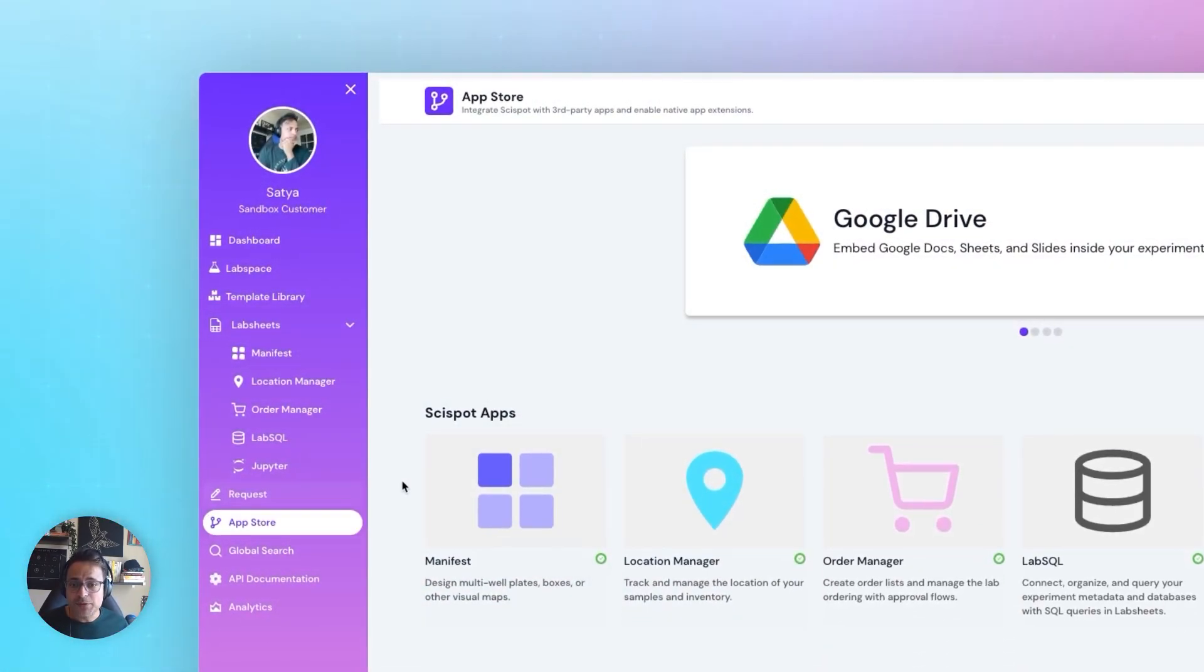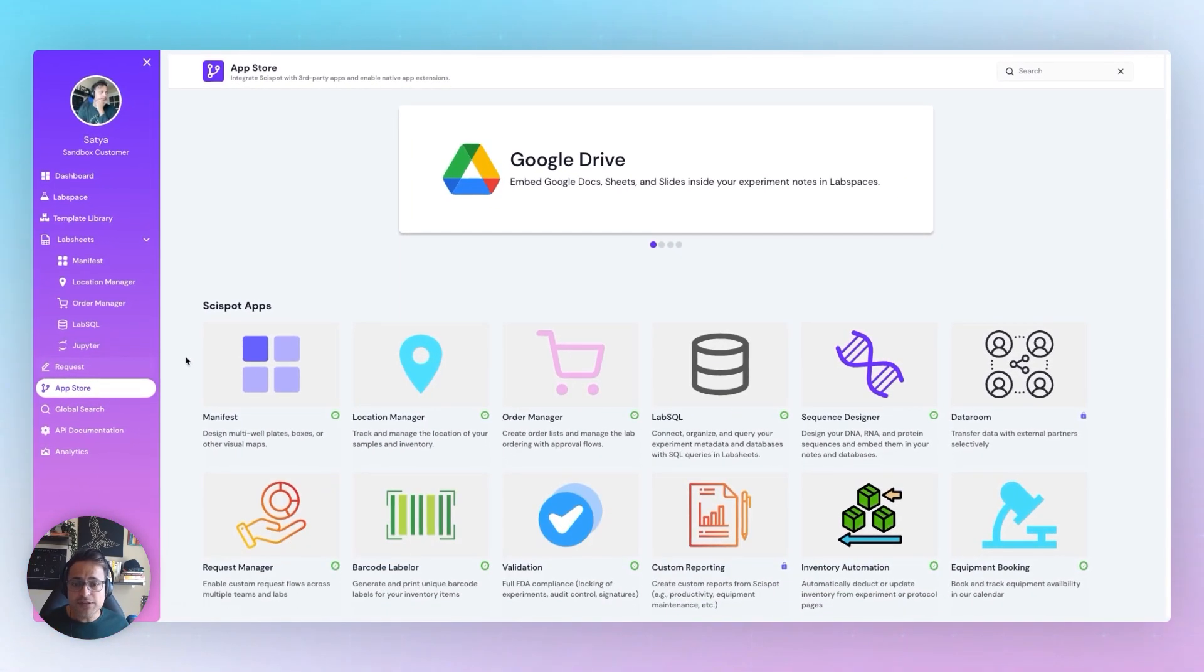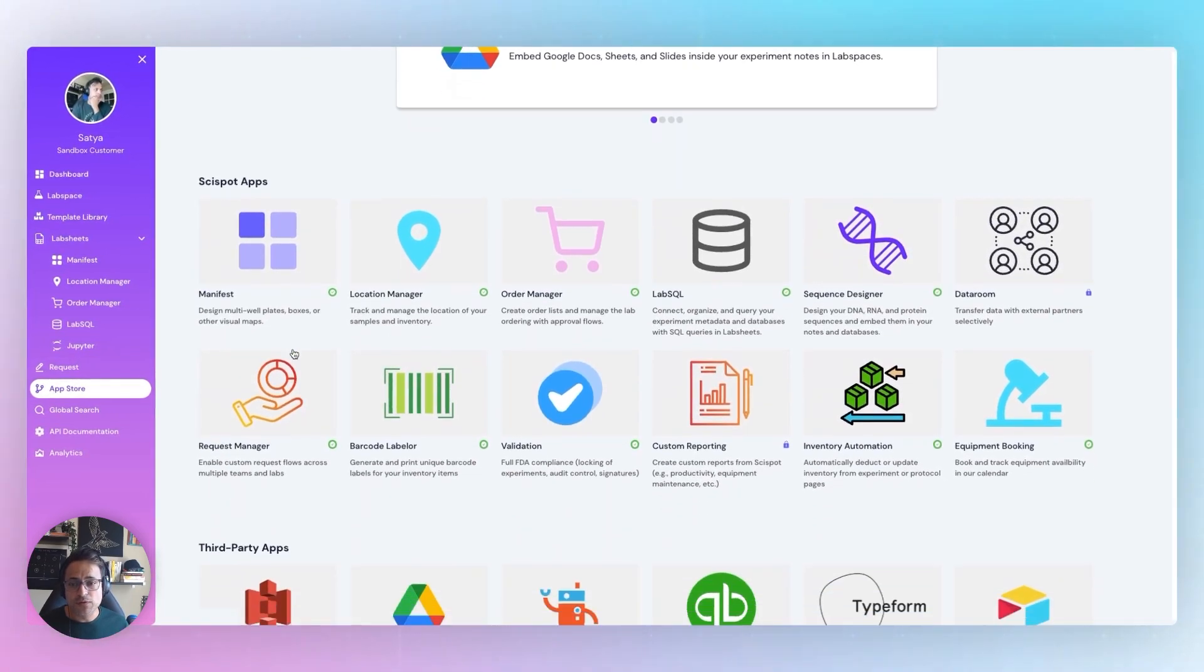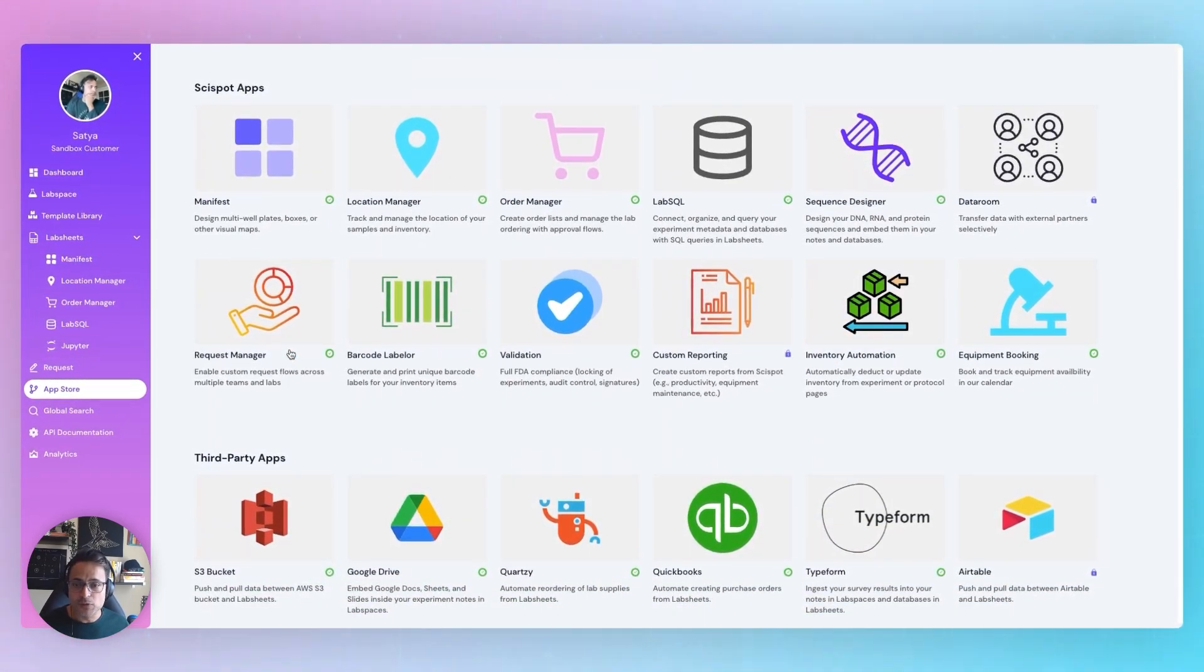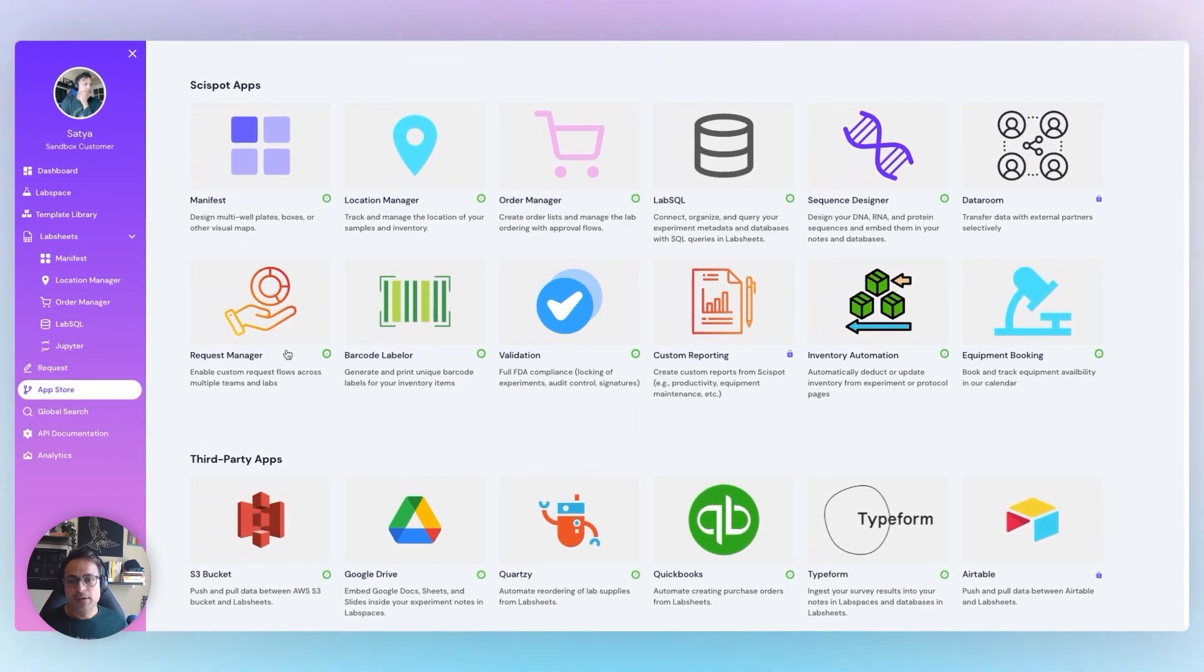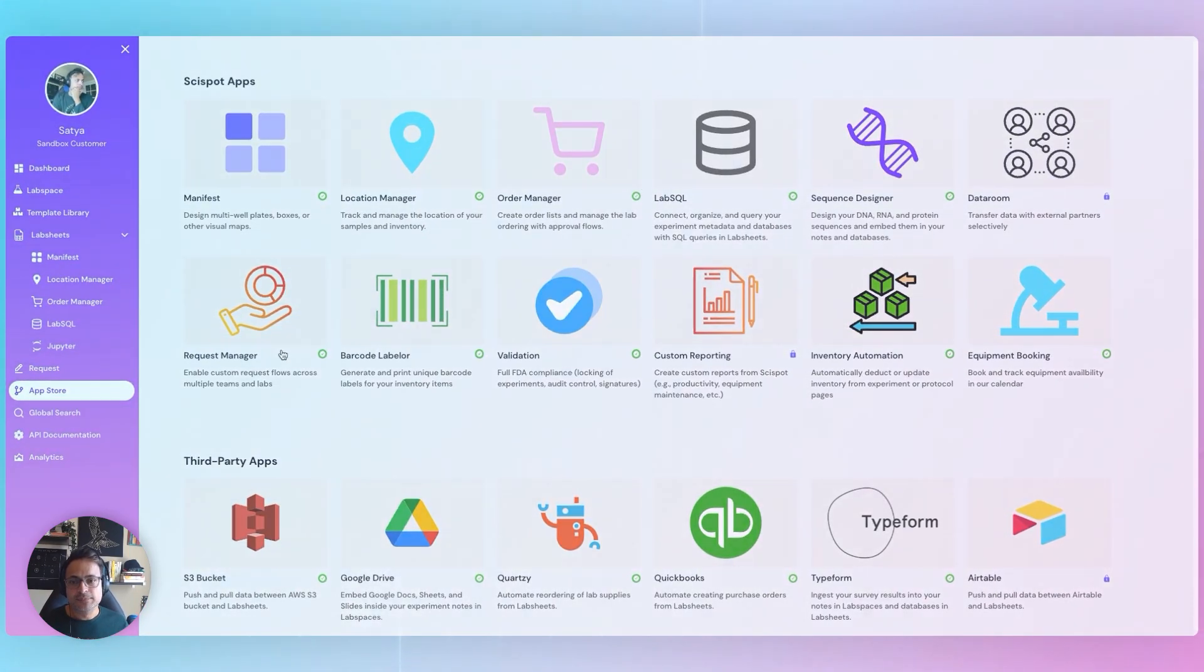SciSpot OS App Store, connect with hundreds of different apps such as Google Drive, Slack, QuotC, Flojo, GraphPad, and many more. Enhance your lab's functionality with just a click.